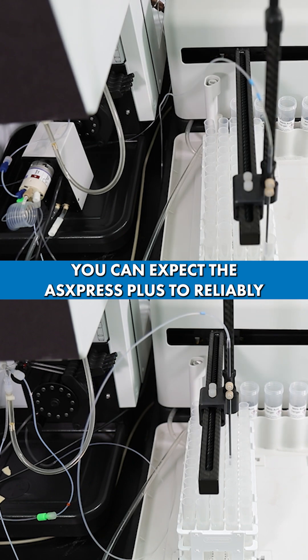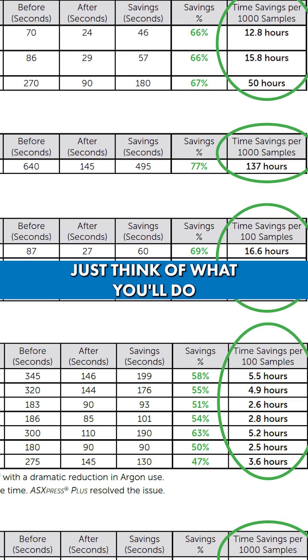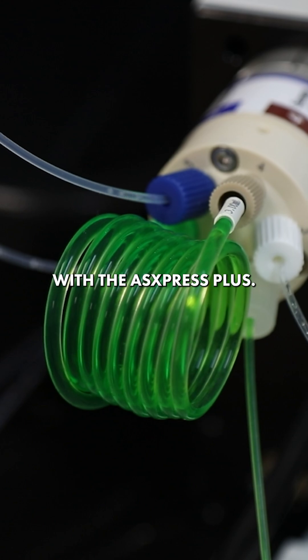You can expect the AS Express Plus to reliably provide time savings from 30% up to 70%. That's a big deal. Just think of what you'll do with all that extra time saved after running thousands of samples with the AS Express Plus.